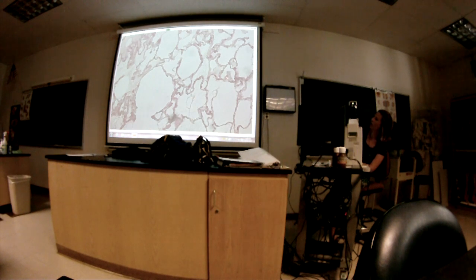Okay, we're going to look at one of these, and there's a particular type of tissue that lines this and makes up its walls. What kind of tissue is this lining? What kind of tissue is lining this structure? And this one up here, and this one. What kind of tissue?